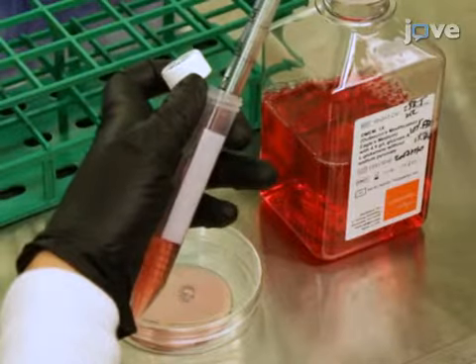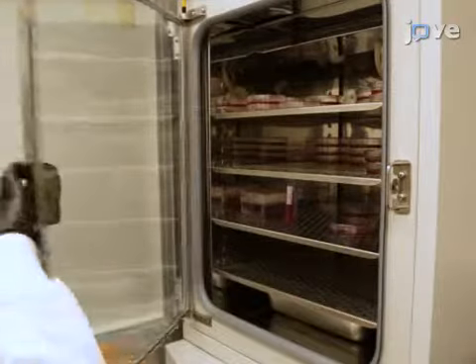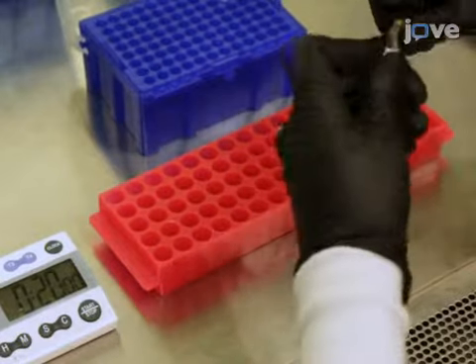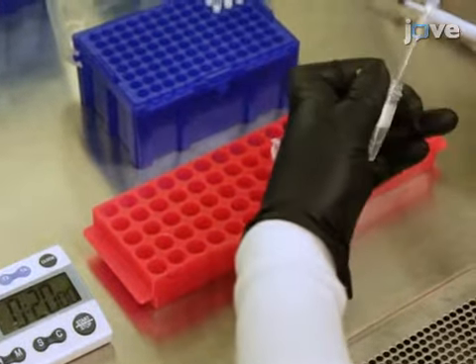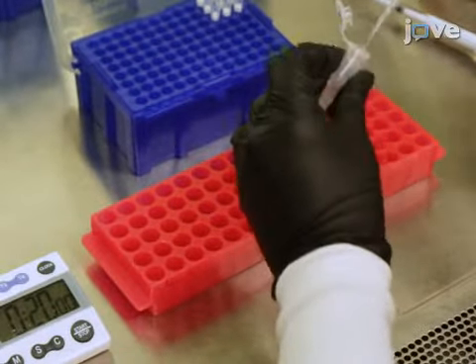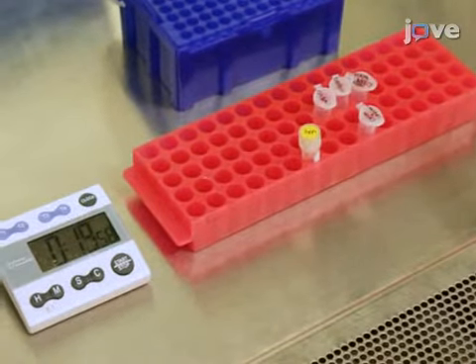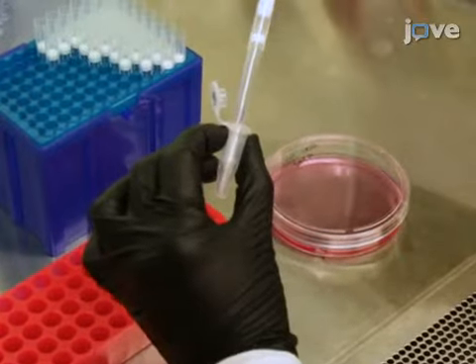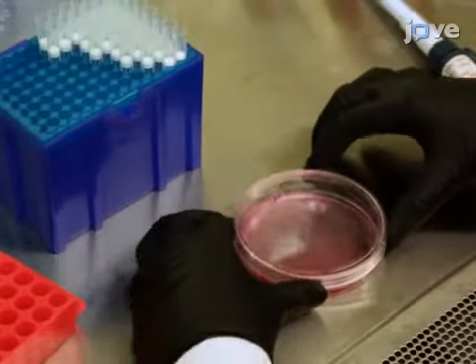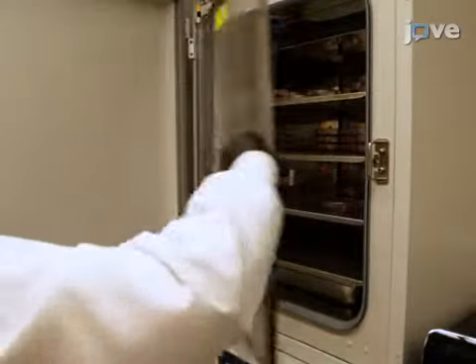Seed HEK293T cells on a 10 centimeter dish and leave it for overnight incubation. To prepare the DNA mixture for transfection, pipette 45 microliters of the transfection reagent to the DNA. Use a pipette to mix the DNA and transfection reagent carefully, and allow it to stand for 20 minutes. After this, add the DNA transfection mixture dropwise on the seeded cells. Gently swirl the plates and incubate at 5% carbon dioxide and 37 degrees Celsius for a day.